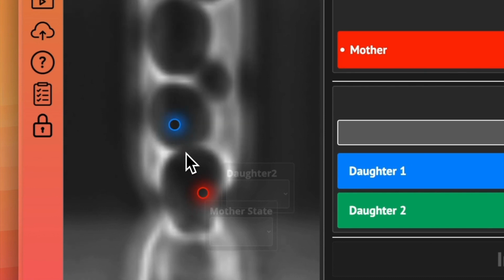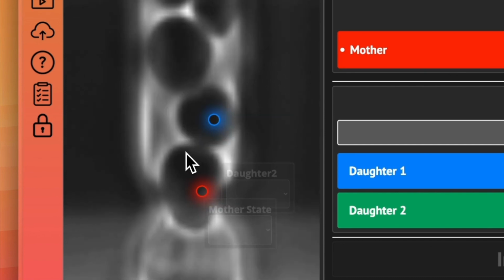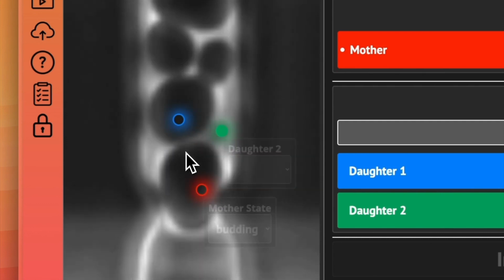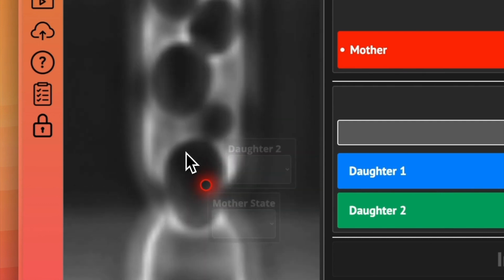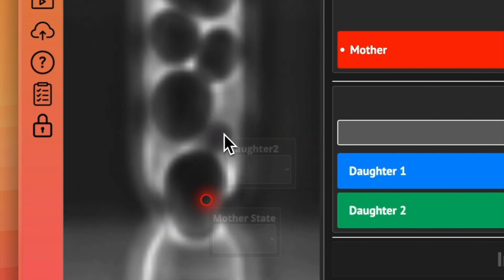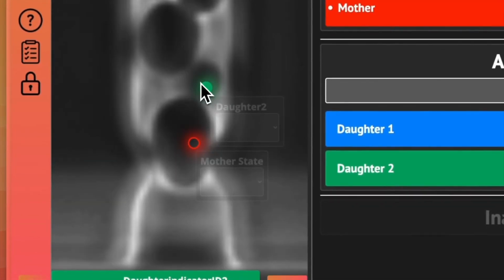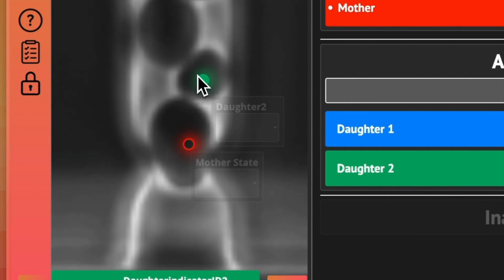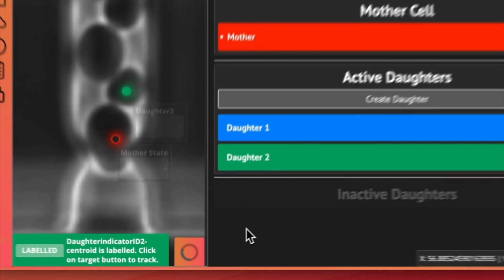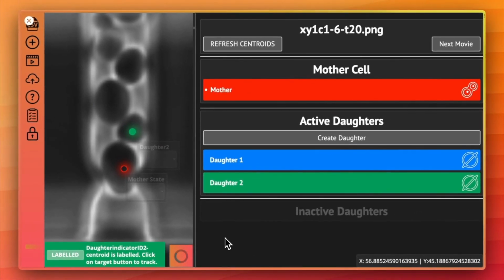And you can see it right there. So let's keep going. We now have again this one, and this one, and this one. So now let's try to see if it's able to track. Again, if not, we can just do it manually.